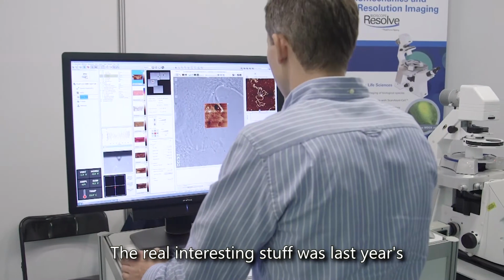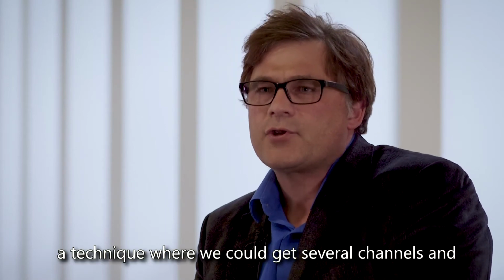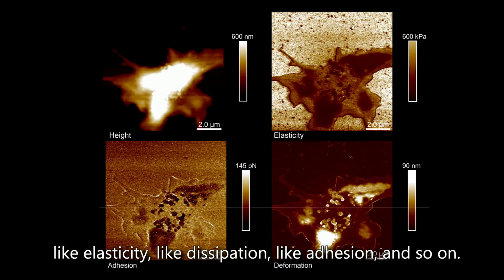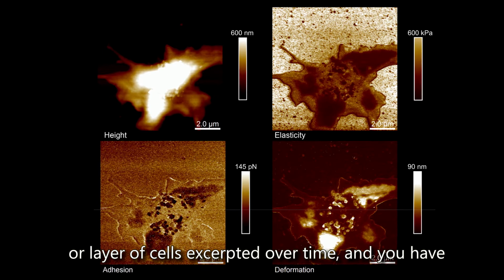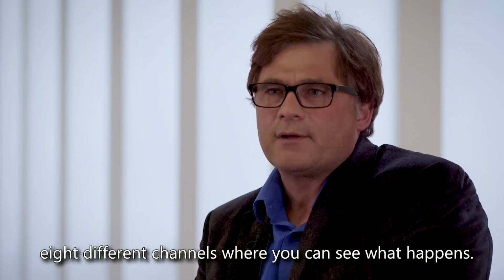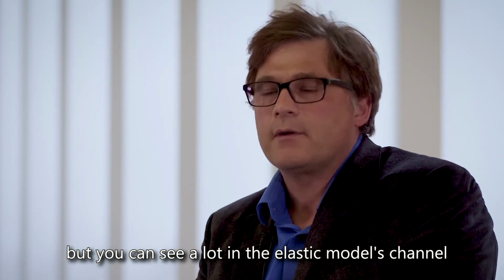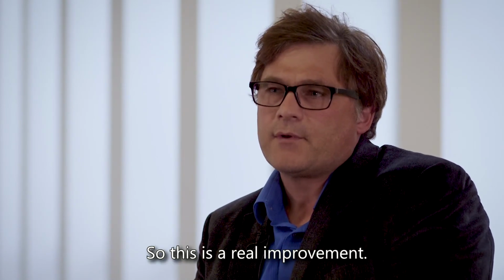The really interesting stuff came up last year with peak force QNM, a technique where we could get several channels, several modes, in one scan process, like elasticity, dissipation, adhesion, and so on. That enables us to observe dynamical changes of a cell or layer of cells in acceptable time, and you have 8 different channels where you could see what happens. So maybe you didn't see much in a topographic channel, but you could see a lot in the elastic modulus channel or in the adhesion channel or even the dissipation channel. So this is a real improvement.